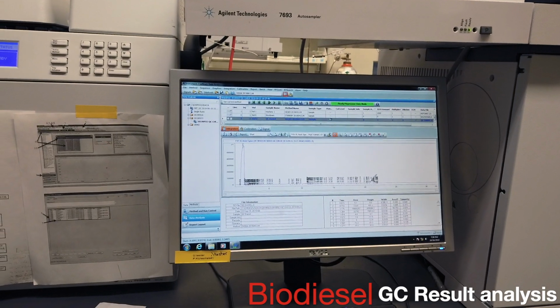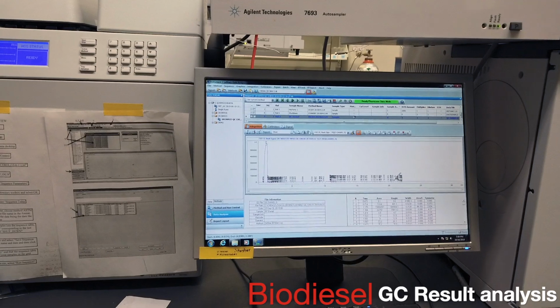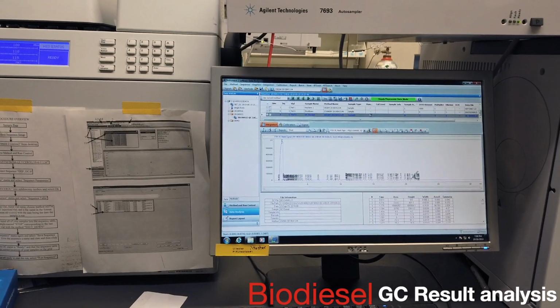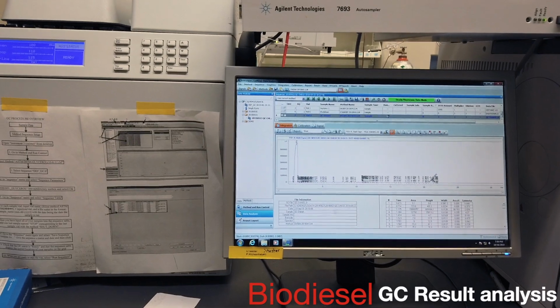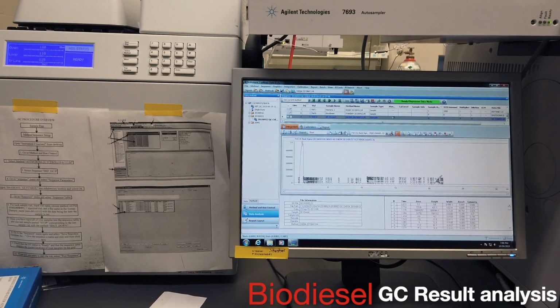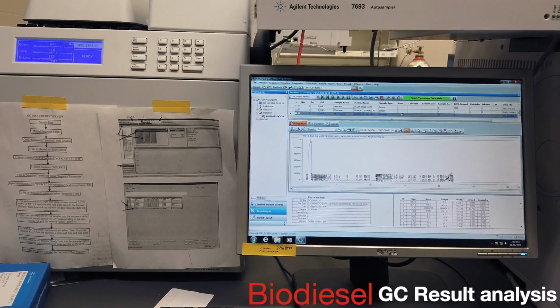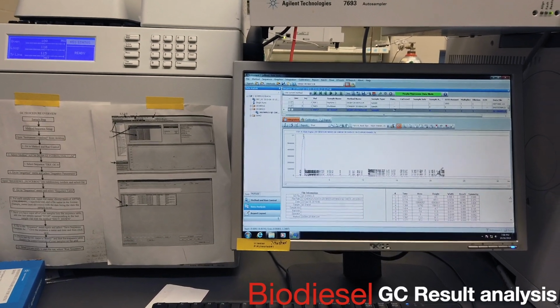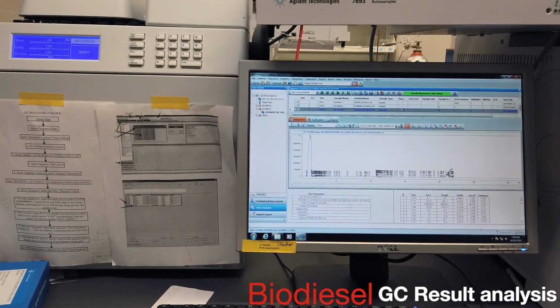He actually did that last time, so he personally knows how to do it. So as soon as you have a sample of your hemp oil, washed, dried and run through the ion exchange column, you can take a sample, mix it up in the vial, run it, and see what your free glycerin and total glycerin look like, and it has to pass the specifications.